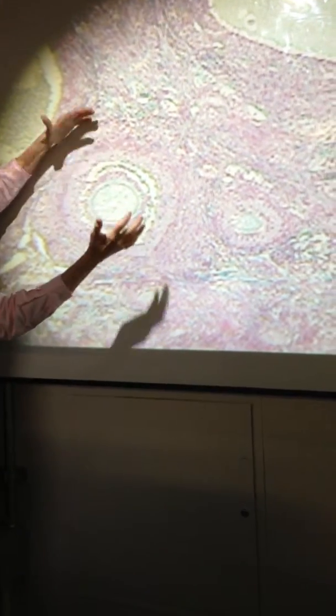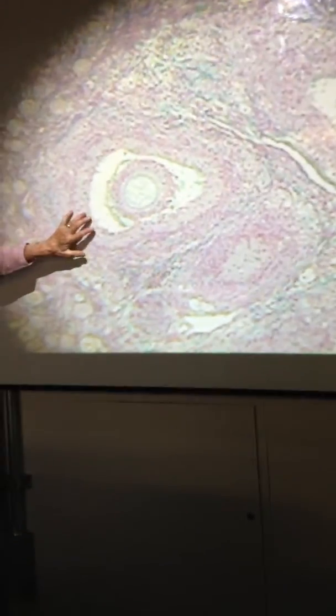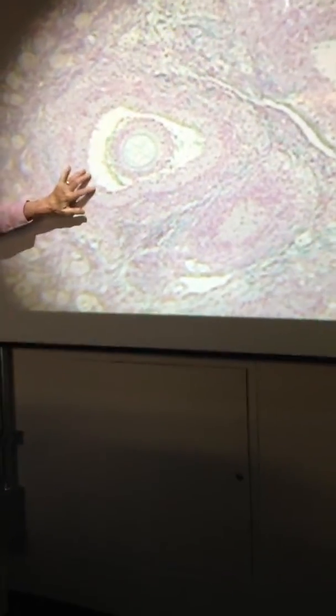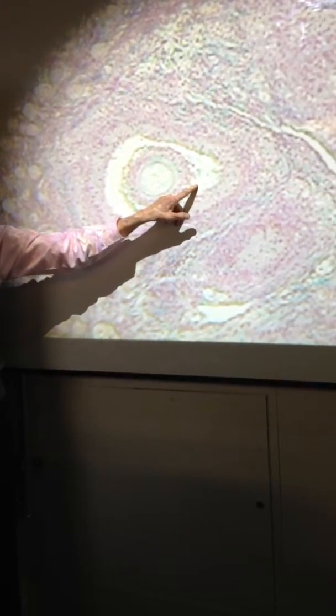Then more and more fluid is produced, and let's see if I can find a good secondary. I'm trying to find, not great. This is, now we have more fluid produced. I wouldn't ask this on the lab practical because I'm going to get both secondary and tertiary.